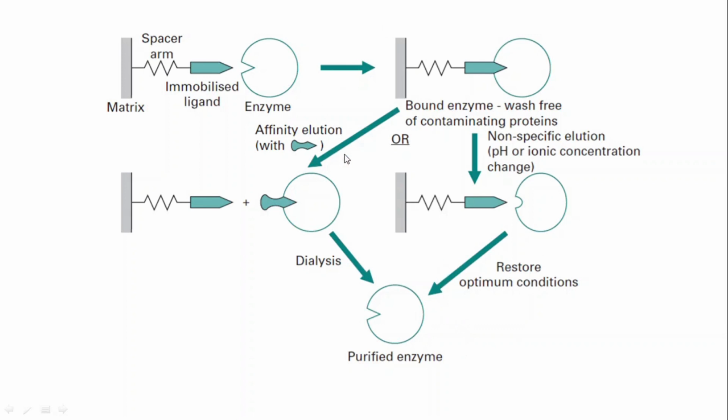These are other ways you can bind the enzyme with the ligand in order to purify it.